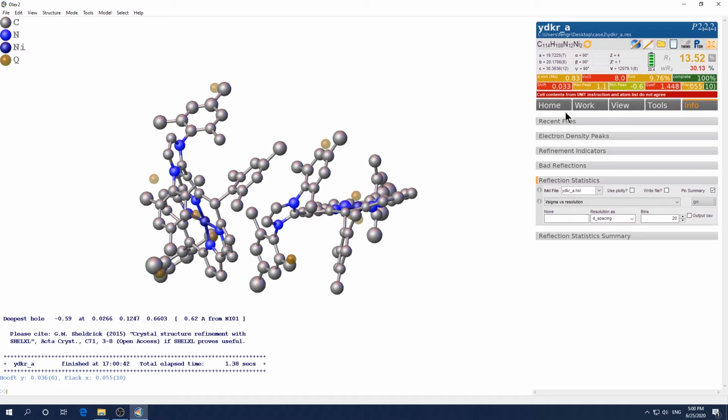The reason is because the original data contains tons of noisy data. It is actually all purely noise. So you include so much noise in your data, it's not contributing positively to the calculation. It actually makes the statistics look even worse. So I normally don't recommend people to cut off the data, even the weak data, but when I over sigma is below 1, you definitely should cut it, okay?